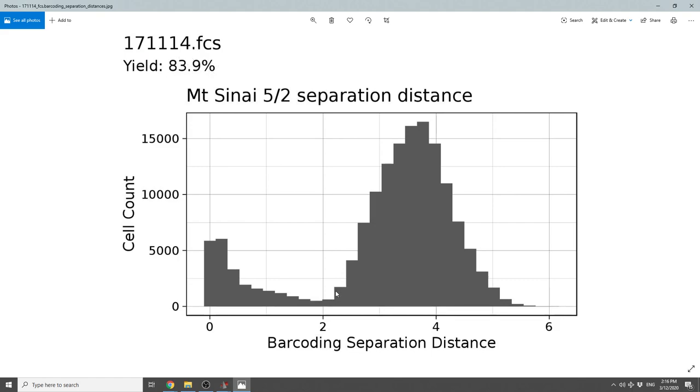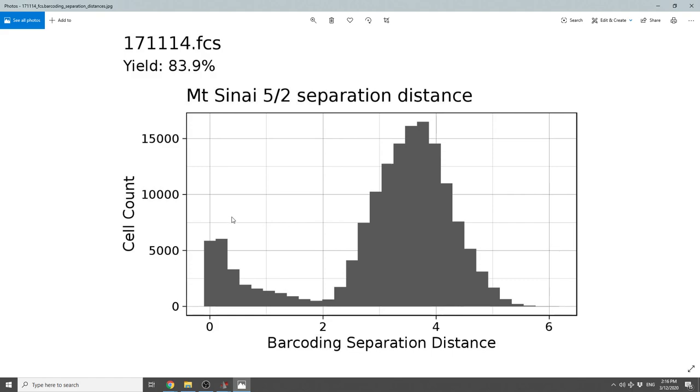Next, we're going to show you the barcoding separation distance for each one of the events. This value shows you for each cell, how close was it to its own cluster compared to other clusters. We want this to be as high as possible. When looking at these kinds of plots, the high peak is going to include real events. The low peak usually includes debris or cells that were not labeled correctly.